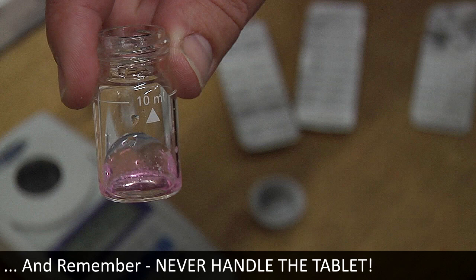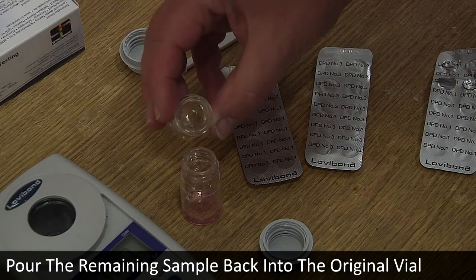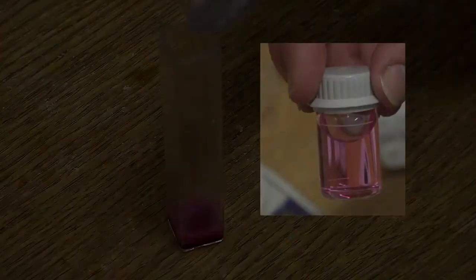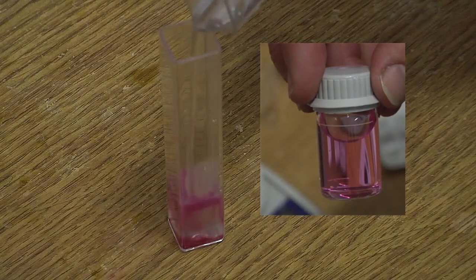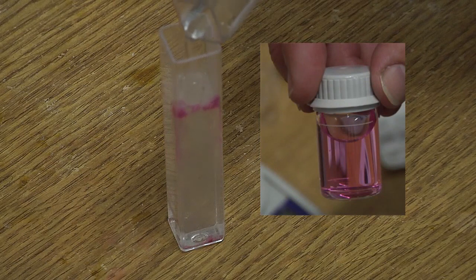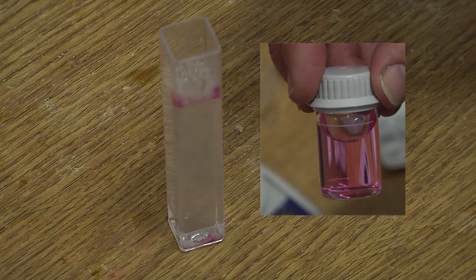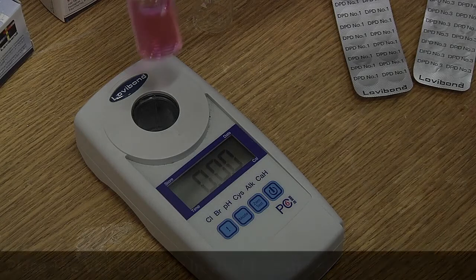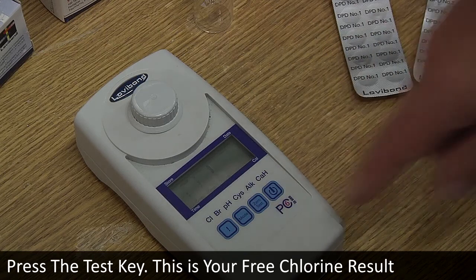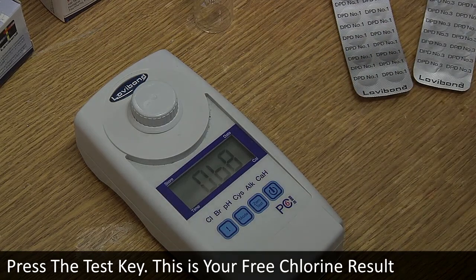Pour the remaining sample back into the original vial and observe the colour during this step. If the pink colour disappears, as in the example on the left, it is an indication of high chlorine levels within the sample, and the sample should be diluted and retested. Place the vial correctly in the photometer and press the test key. This is your free chlorine result.